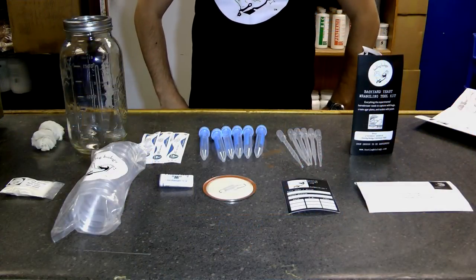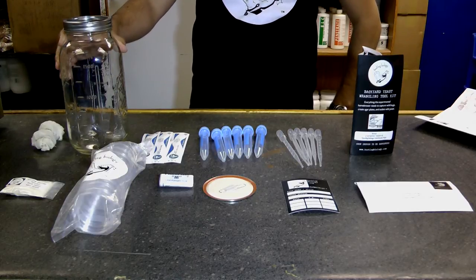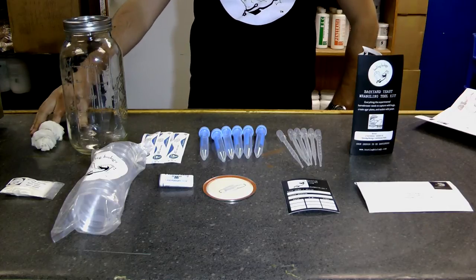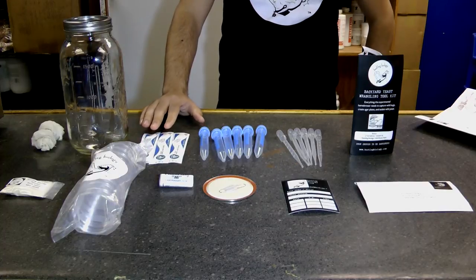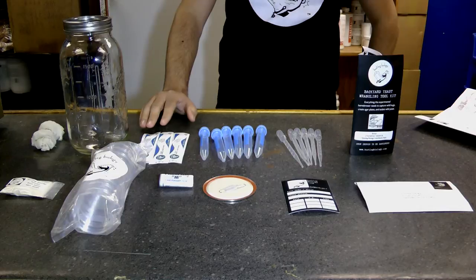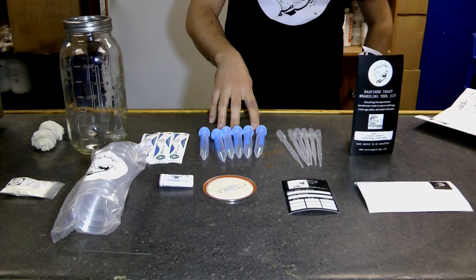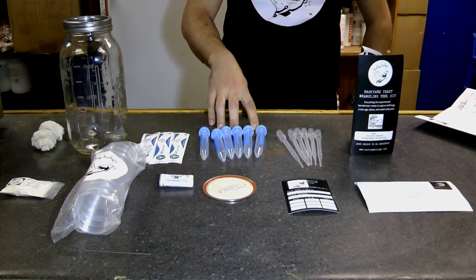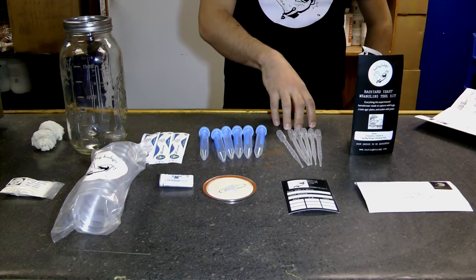Everything you see here is in the Backyard Yeast Wrangling Toolkit. Everything is inside a half gallon mason jar. We also have cheesecloth and sterile cotton tip swabs. You can use swabs for capturing yeast off a large fruit, also for transferring yeast. Additionally, centrifuge tubes, which are a great way to capture yeast if you have small fruit — you can also store your yeast for long-term periods. Pipettes are a good way to aseptically transfer yeast from a tube to a different location, and to grab yeast from areas that are hard to reach.